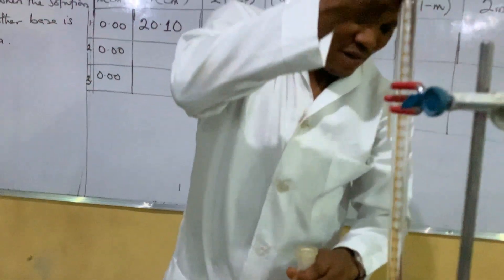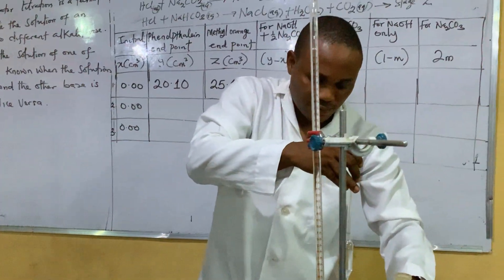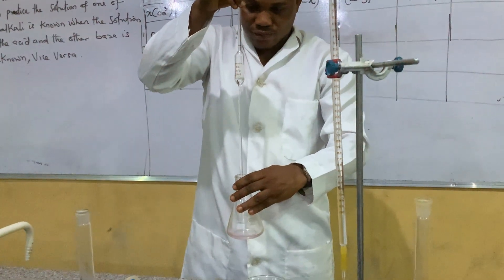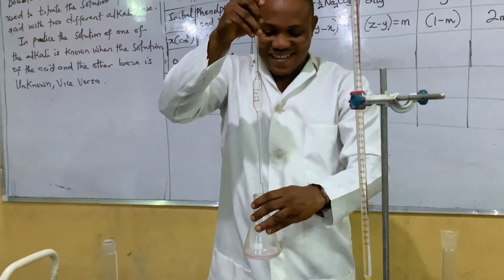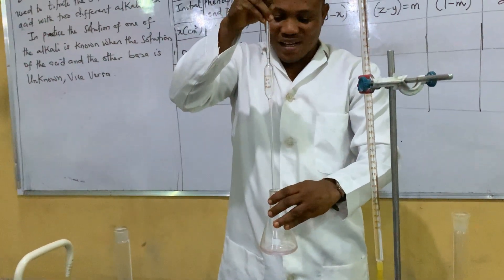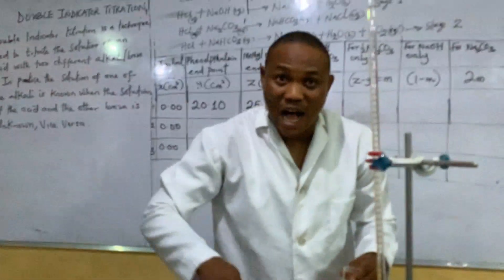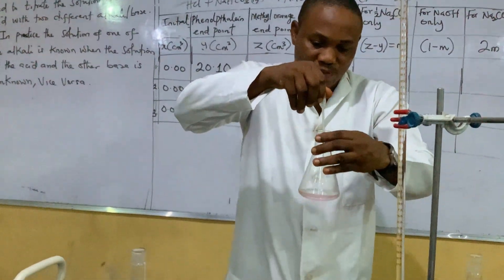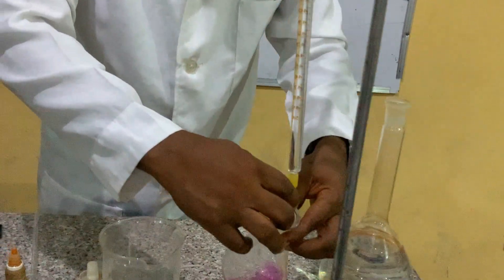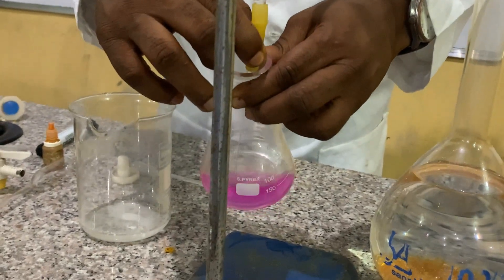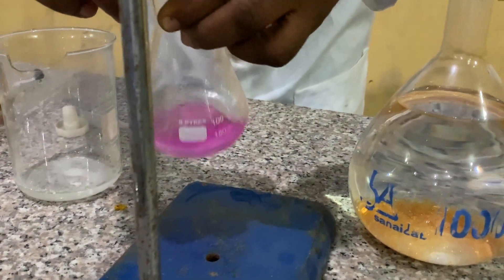Okay, perfect. Let's drop it. I want to believe we are getting this. I told you from the beginning of the video that it's going to be interesting. So don't forget — what did we start with? I hope you have not forgotten — it's our phenolphthalein. So let me do that — two drops: one, two. Did you see the color? Don't forget on the zero. So let's go again. We already know the average now — there is no need to waste time. I already know the average to be around 20.